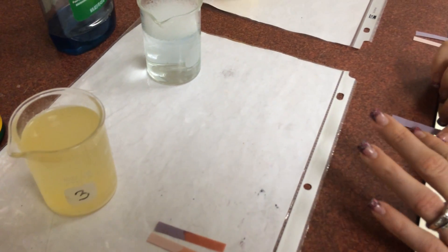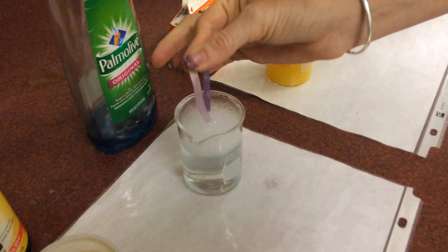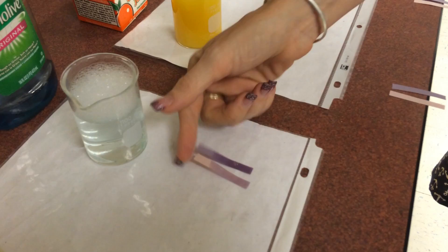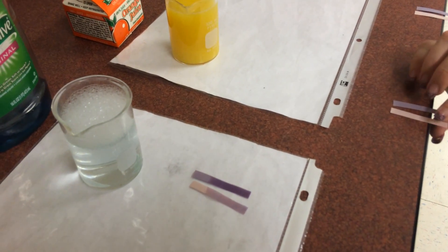Soap - we can guess, based on what we know about acids and bases. We dip our litmus through the bubbles here, and blue and blue means - what does it mean? That's right, it's a base.